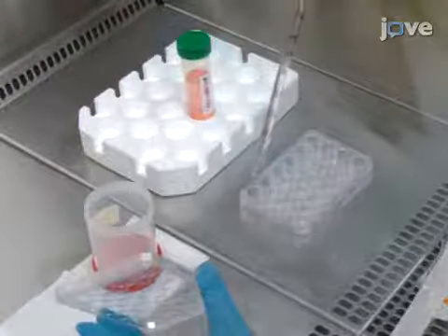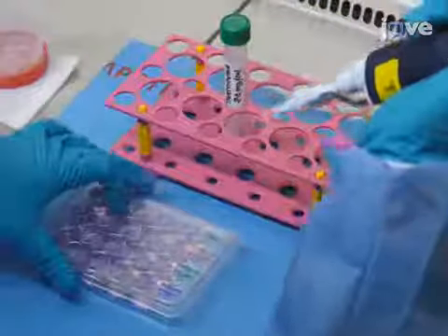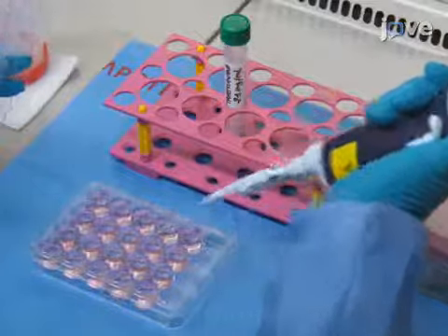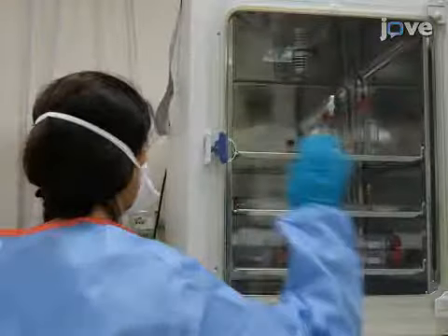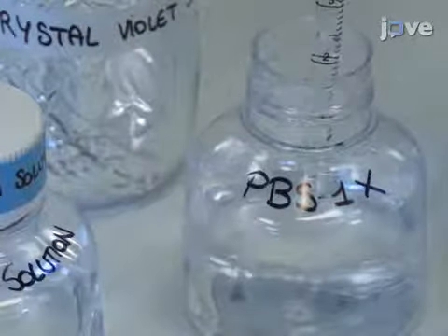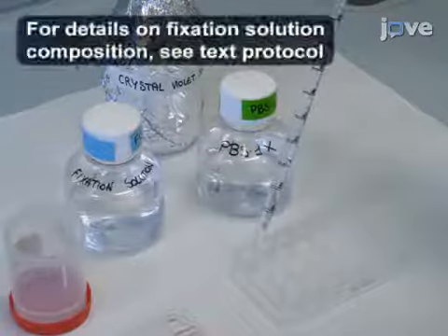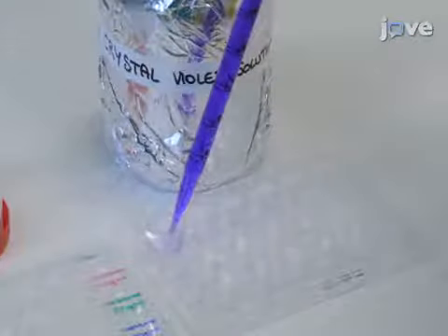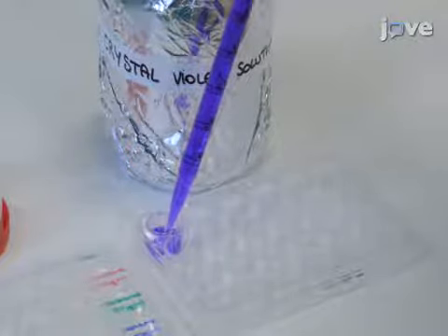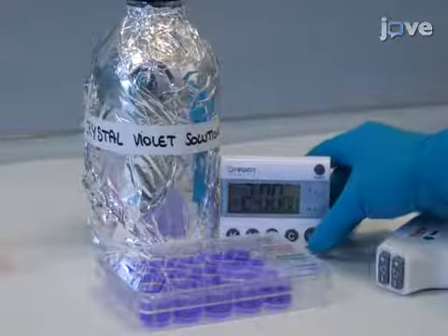Next, seed cells into 24 multi-well culture plates. Expose the seeded cells to increasing target therapy inhibitor concentrations from 100 micrograms per milliliter to 400 micrograms per milliliter. Incubate in a CO2 incubator at 37 degrees Celsius for 15 days. After this, remove the medium and rinse the cells with 10 milliliters of PBS 1X. Remove the PBS 1X and add between 2 and 3 milliliters of fixation solution. After 20 minutes, remove the fixation solution and add 2 milliliters of 0.5% crystal violet solution to each well. Incubate at room temperature for 2 hours.